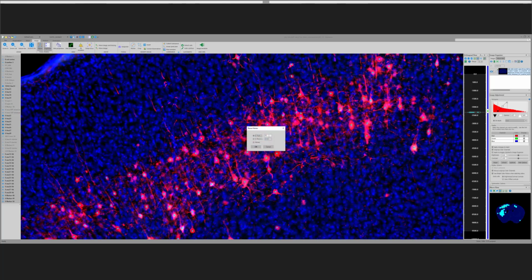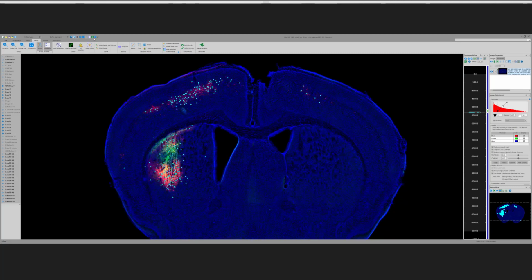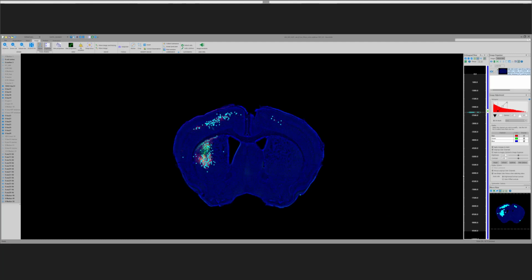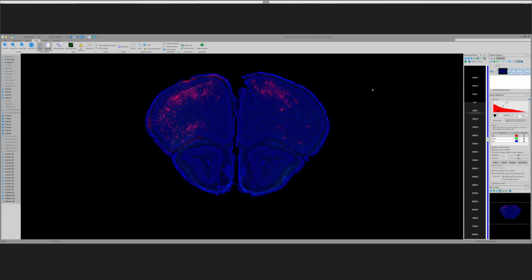Over here, I can change the size of the markers. I'm going to view, then pan out a little bit. So in this window, we can navigate and change the markers and either view markers or turn them on and off. And in the actual experimental brain images, as I said, we can go to the front of the brain, looking where the cortical neurons are, and I can scan through.